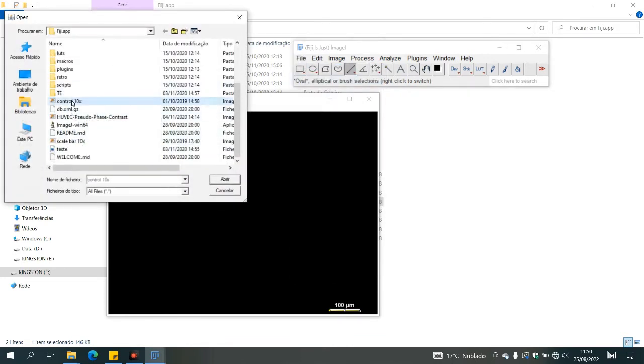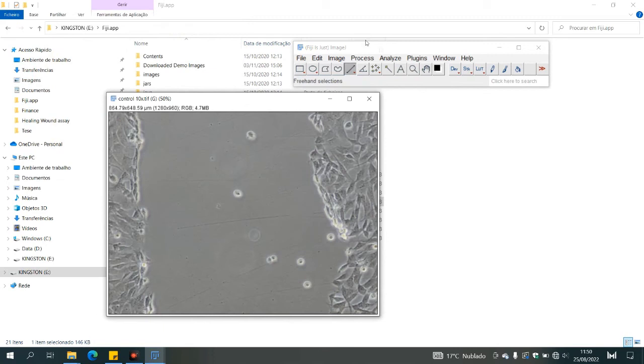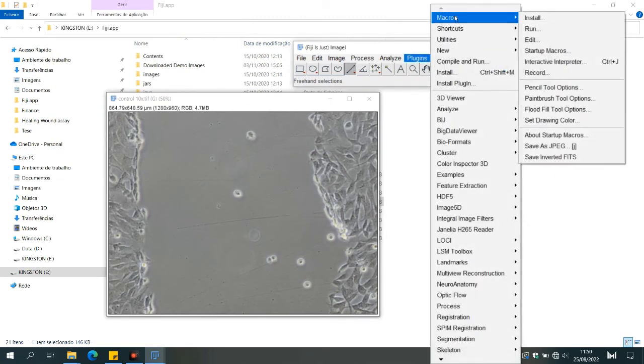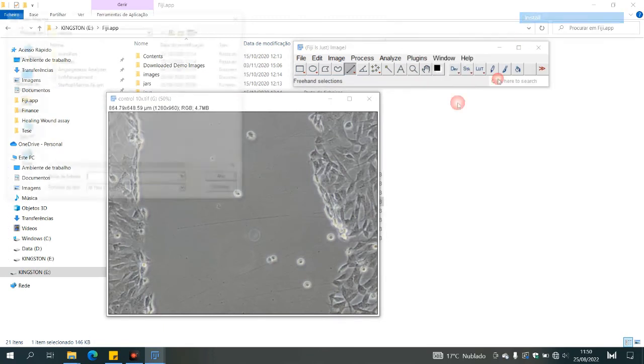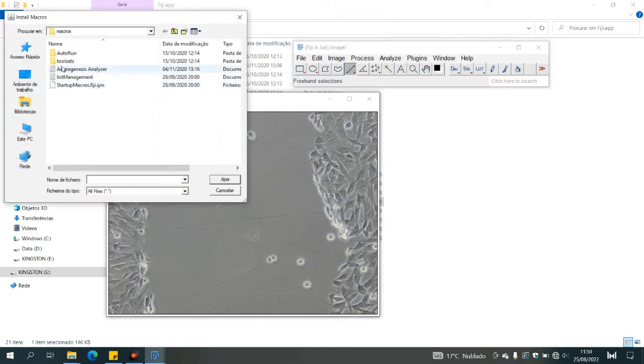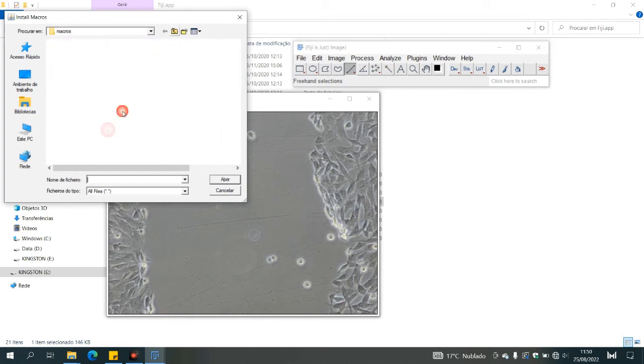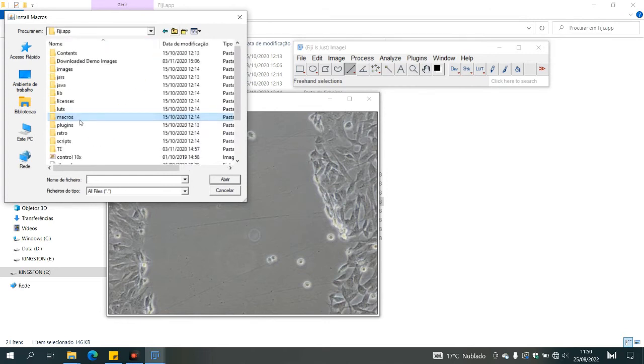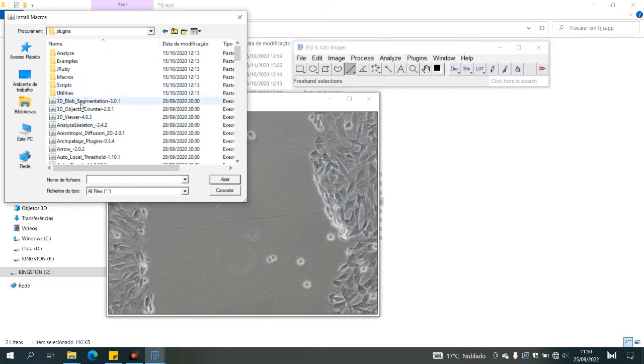Then you need to go to plugin again, macros, install. Then go to the plugin file where you placed the wound healing assay plugin. Click on it.